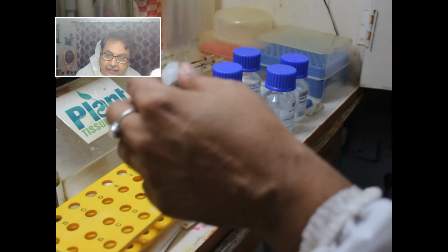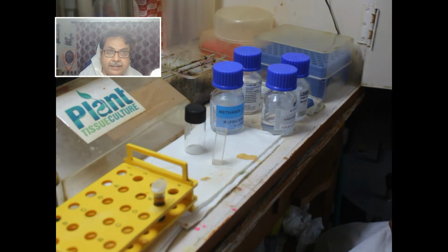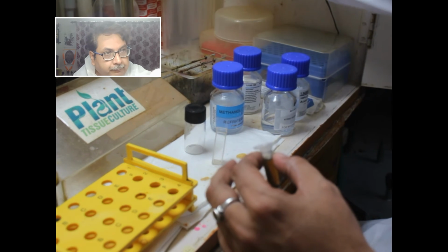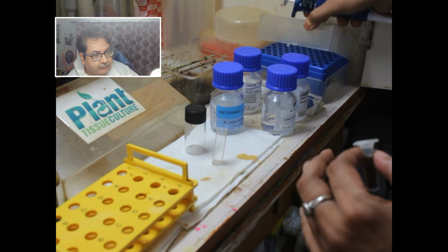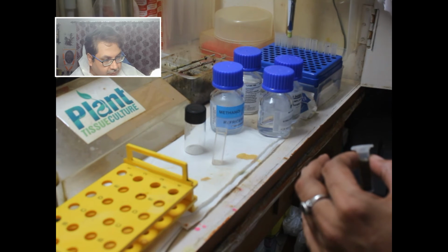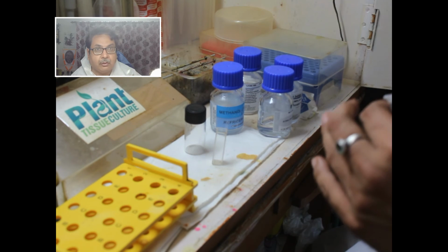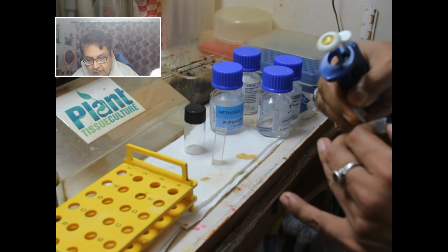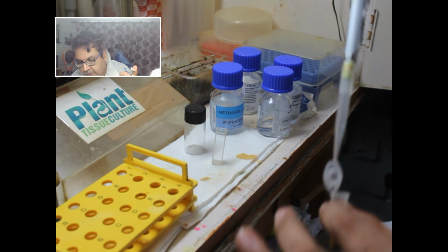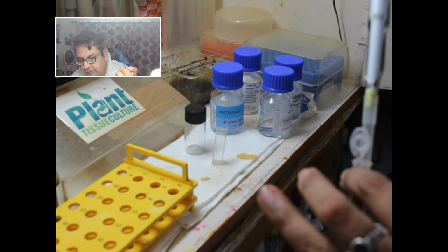Our centrifuged fungal media is ready. So what we will do is very easy. We will remove the fungal base with a pipette, and be careful about the measurements. Please be careful about the measurements of these solutions, the solvents actually. So you have to keep this in mind.